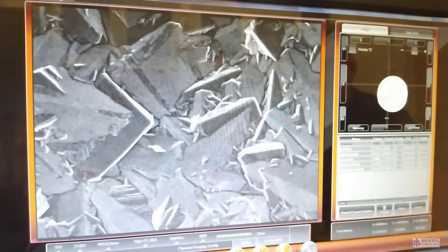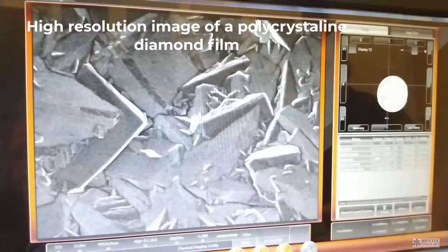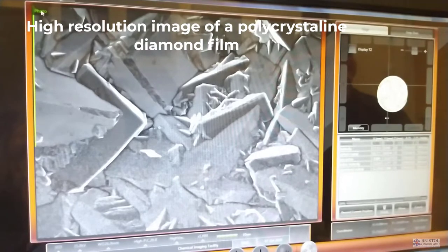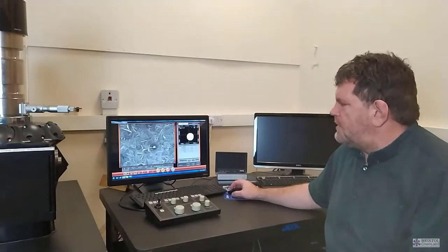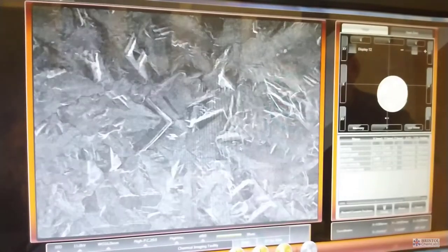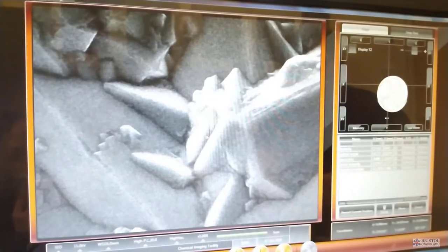Focusing is just turning the dial and in this case, what we're actually seeing is a polycrystalline diamond film. There's a research group within the department who focus most of their efforts on producing crystalline diamond films. This is one of the samples from an undergraduate project. You can see the crystalline facets of the diamond film. We can keep zooming in, but the grains are in a millionth of a meter size range, so we don't see any more detail.